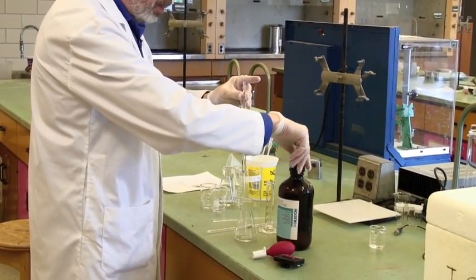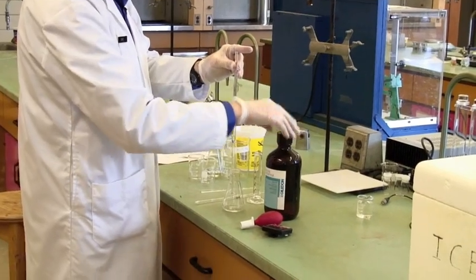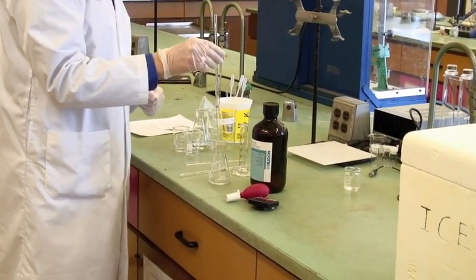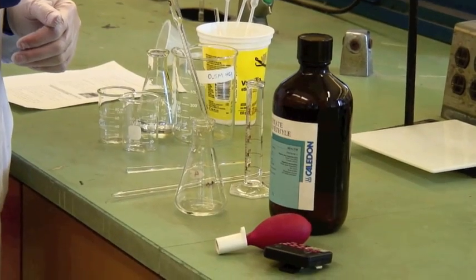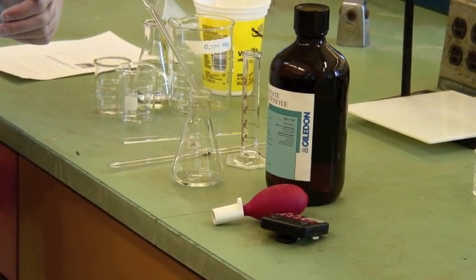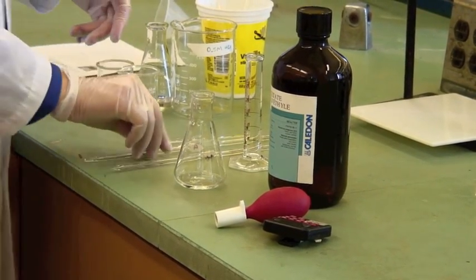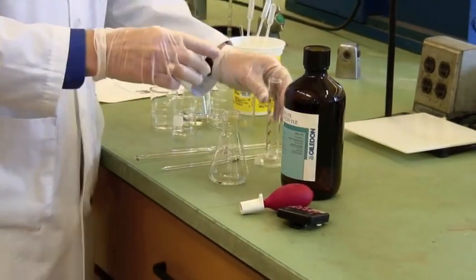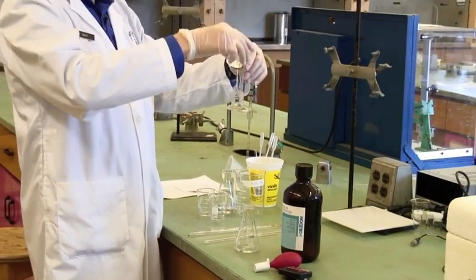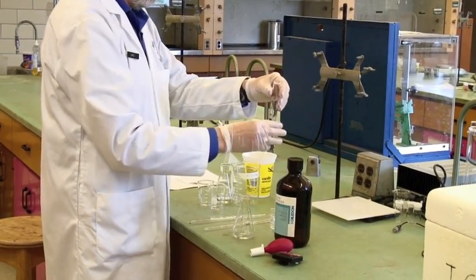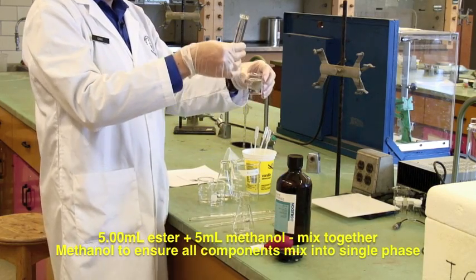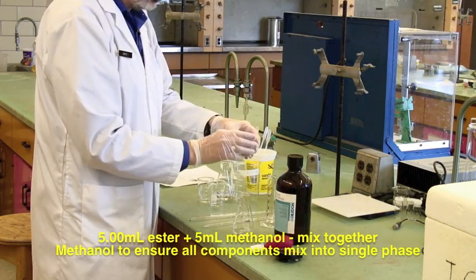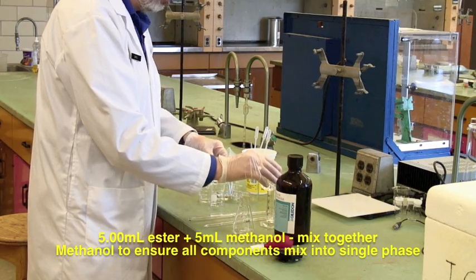We'll also be mixing the ethyl acetate with 5 mLs of methanol. Now, the methanol doesn't actually enter into the reaction. It's just there to make sure that the ethyl acetate actually mixes with the ester. They're not completely miscible.